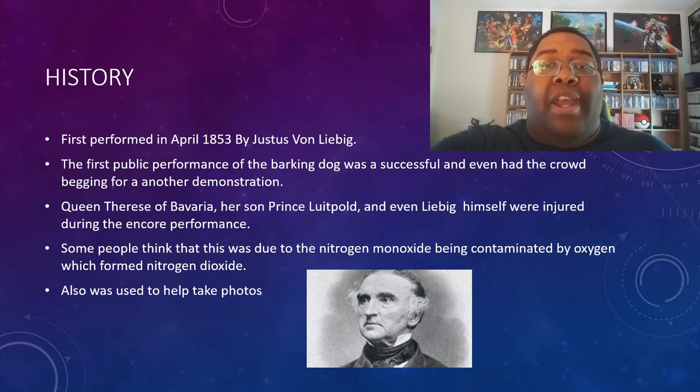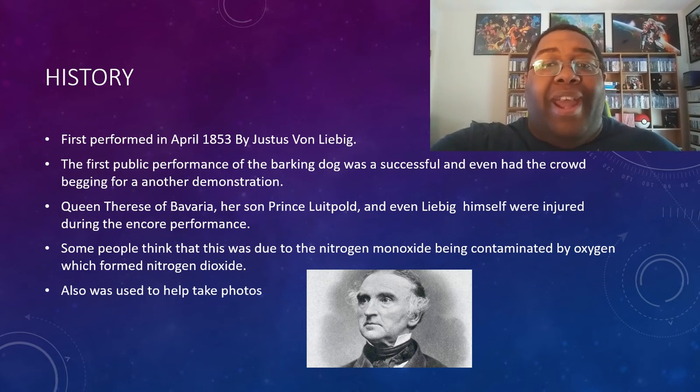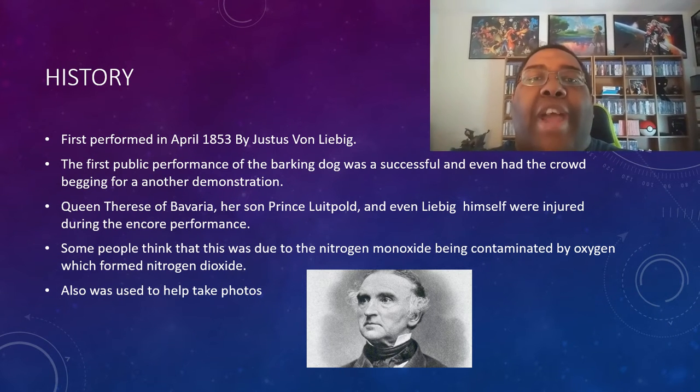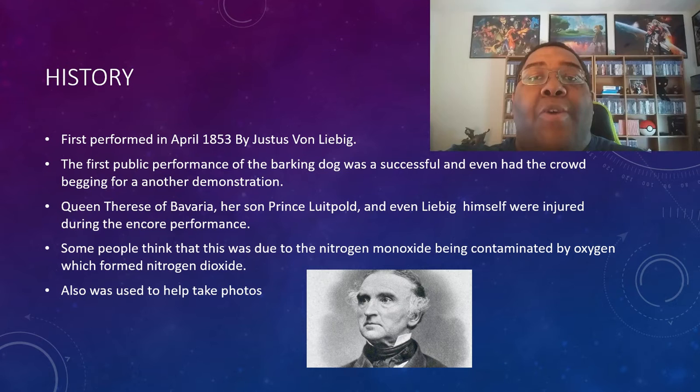The first experiment went off without a hitch. The crowd, and even the Queen of Bavaria and her son who were in attendance, were amazed by this never-before-seen sight — so much so that they wanted an encore. And how could Eustace refuse? The queen herself wanted an encore. But this is what came back to haunt him later on. There was an accident during the second demonstration that resulted in him injuring not only himself, but the queen and her son as well.